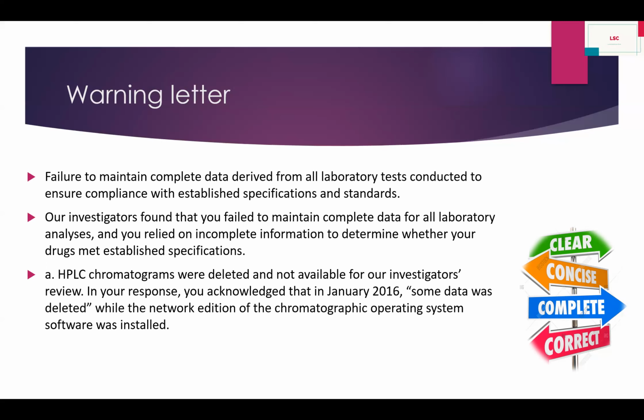Not complete means, if your specification has A to Z parameters, your data is not complete. So the investigation says that complete data is not there. HPLC chromatograms were deleted and not available for investigator review, meaning the chromatograms, the electronic records, were not available. In your response, you acknowledge that in January some data was deleted while the network edition of the chromatographic operating system software was installed. So this is one example.